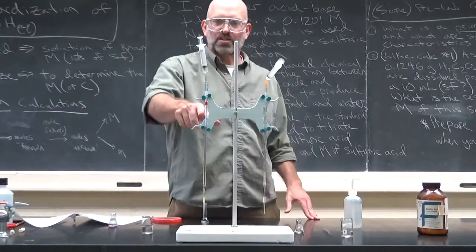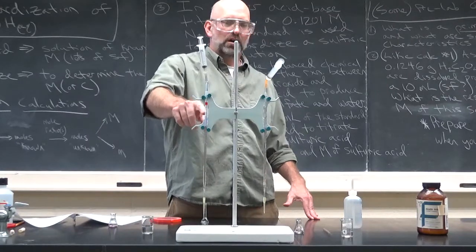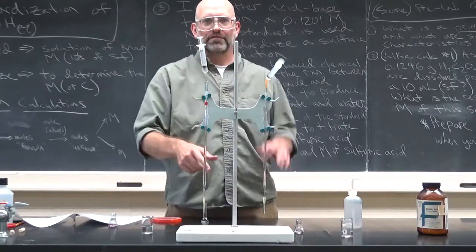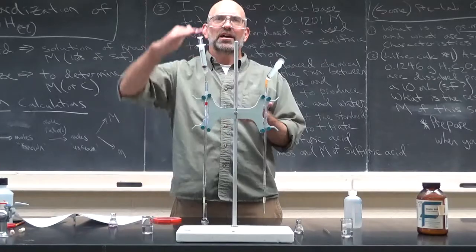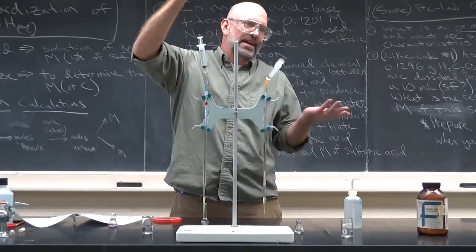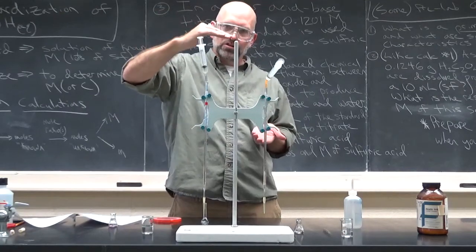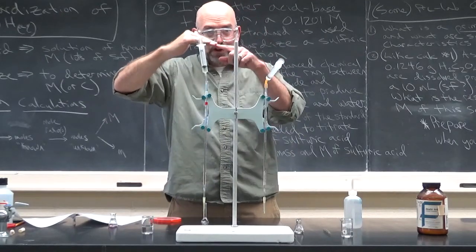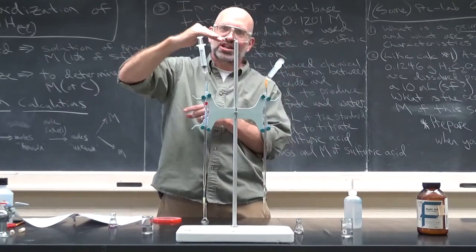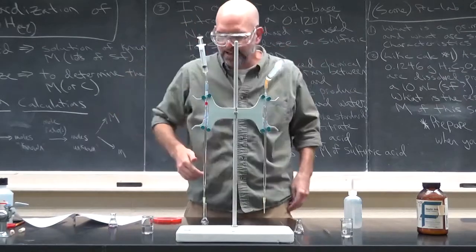or I let the tip come out of the liquid there because I was in a hurry. Well, make sure the tip doesn't fall off. You'll probably have to push all that liquid out and fill it up slowly again. Okay. So if you start at 0.00, you'll have plenty in one burette full to do all three titrations. So you record the initial volume. Again, if it's 0.00, awesome.